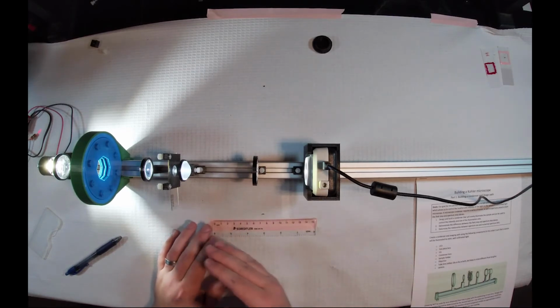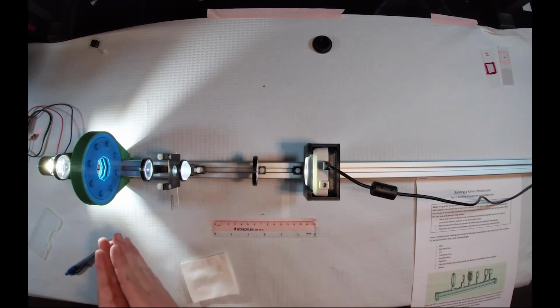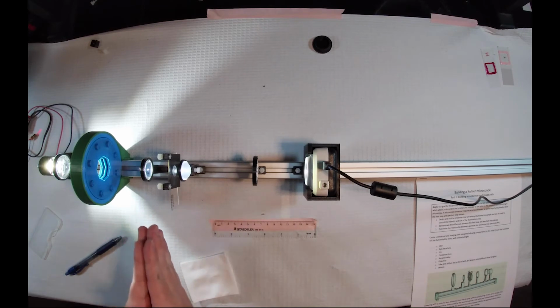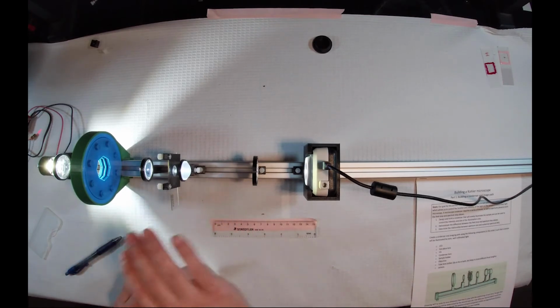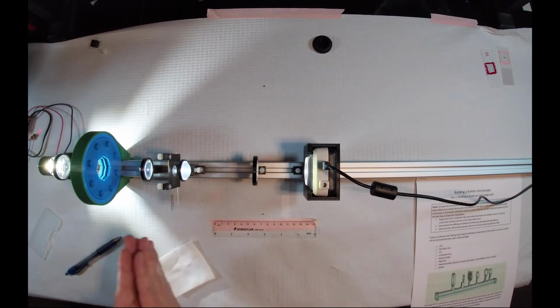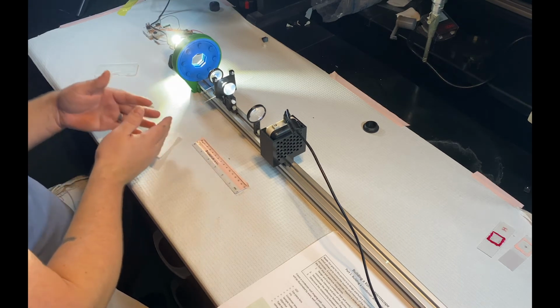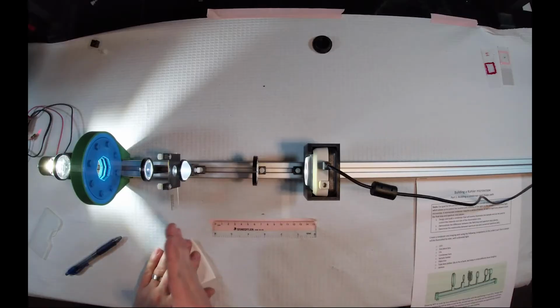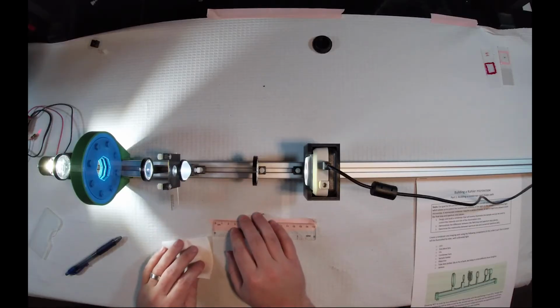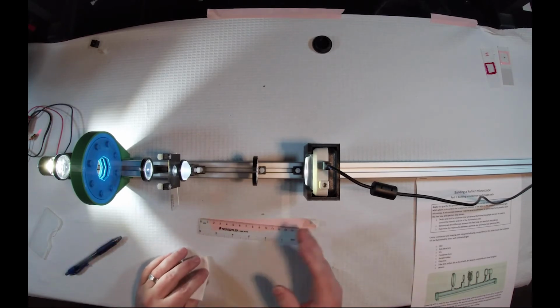So this is again one of the many advantages to building a Köhler microscope. Additionally, you get a much more even illumination because we do have light that is being delivered by our condenser into a nice, perfectly evenly illuminated plane that is, again, very forgiving depending on where you put your sample, even if you're a little bit further back or further forward. Because the light is focused, it is nice and even no matter where the sample is placed. All right, so this is a roughly aligned Köhler infinity corrected digital microscope.